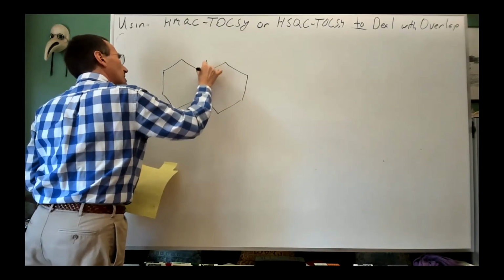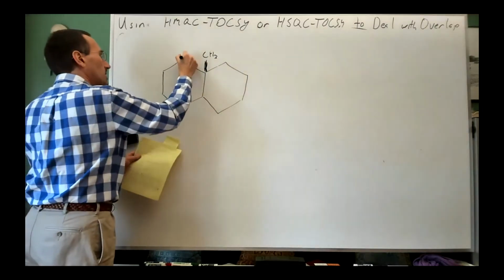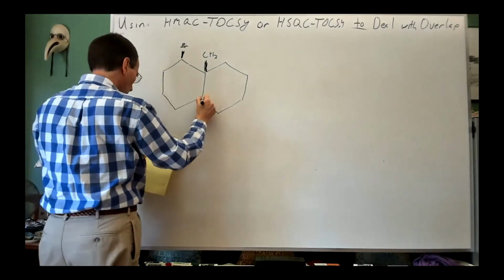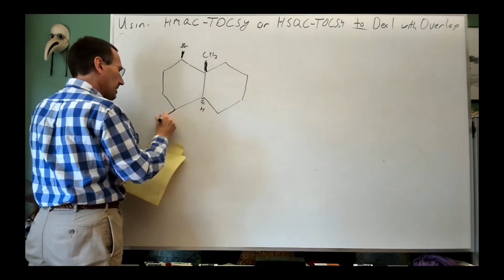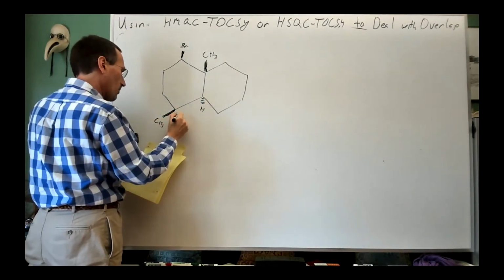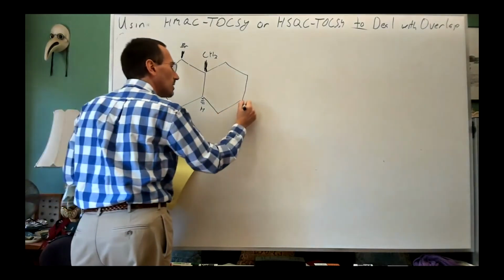So here's the molecule that's going to be our reactant in the problem that we're about to see. It is called bromomalliol. It's a natural product, probably a marine natural product because it contains a halogen.